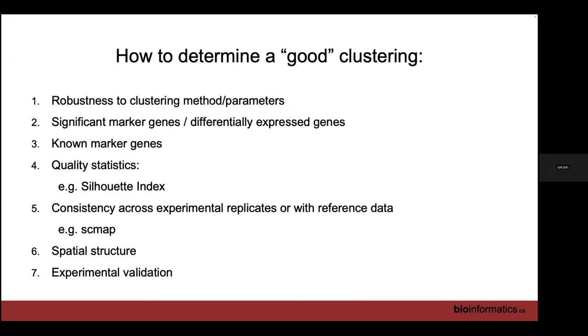All right, so how do we determine if we've got a good clustering out of our clustering algorithm? There's lots of different scores we can use for this. Again, similar to there being no right answer for what the best clustering method is, there's not necessarily a best answer for how to determine a best clustering. So you want to do lots of different measures, and hopefully they'll all agree on the same set of clusters.